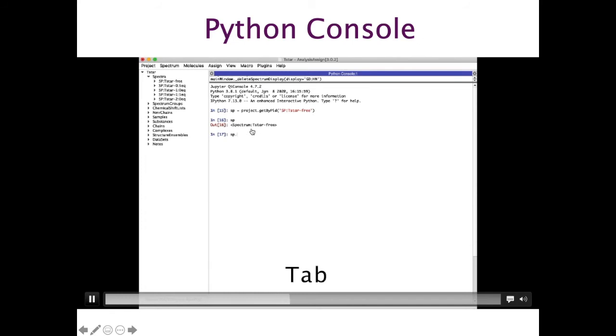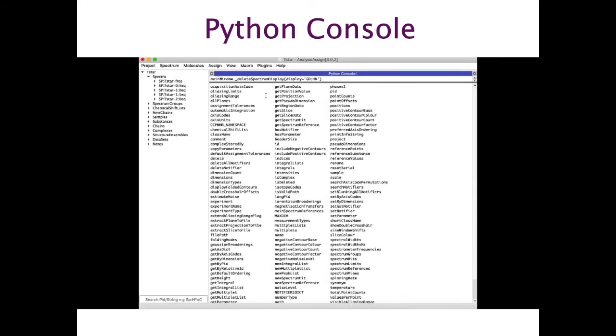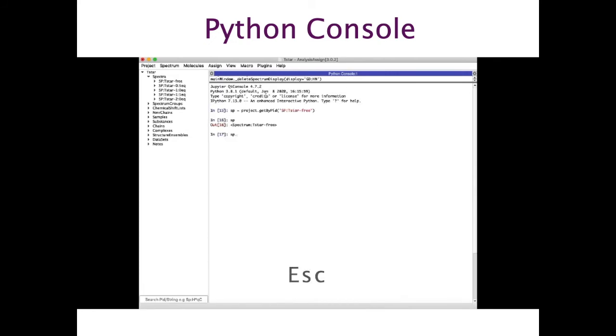And then if I type sp.tab, I get all these properties and methods. I'll escape and get back again. And perhaps if I just type sp tab, then I can just see all those starting with sp and find, okay, here we go, spectral widths, hertz, that's the one that I was looking for, and then those values echo to me.